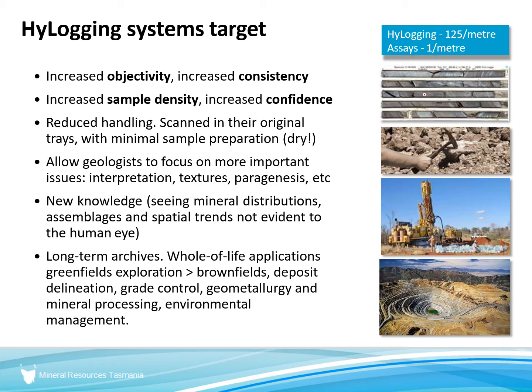It gets lots and lots of samples, so we're talking thousands and thousands of samples, tens of thousands of samples in a drill hole, which gives us increased confidence. We get reduced handling because the core is scanned in the original trays dry. It allows geologists to do other things.